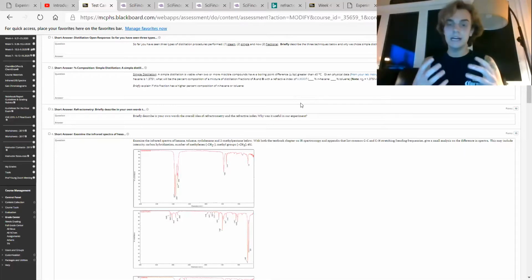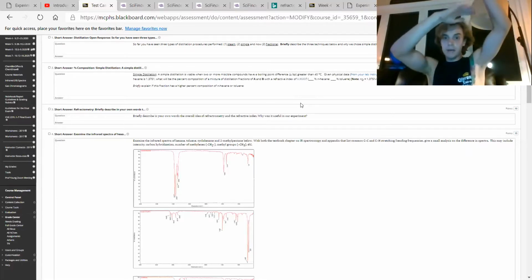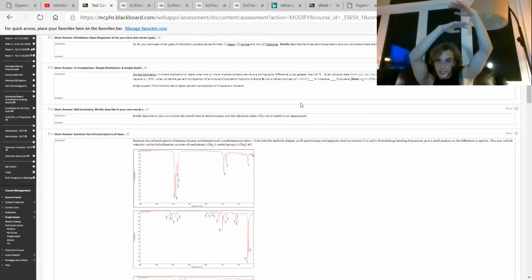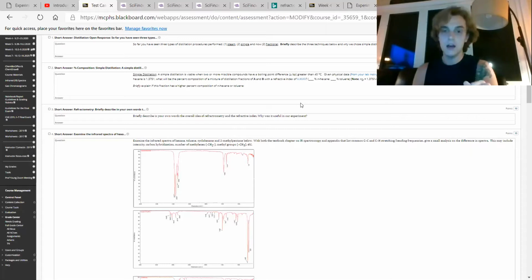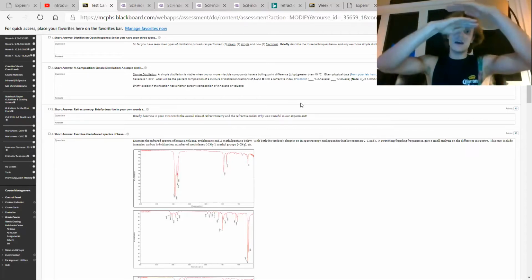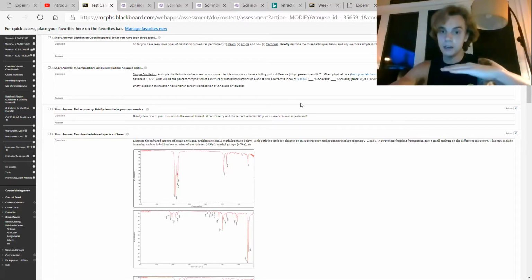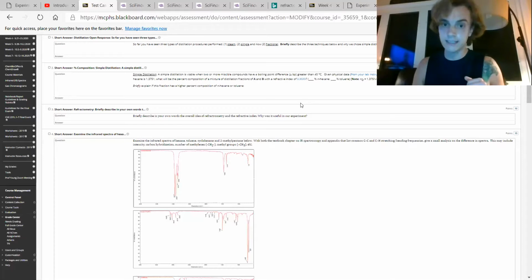So if you're heating the bottom of this system and the top of the system is not heated, and it's a mostly closed system, meaning the top of it is only obscurely closed, then we are able to quantize the volumetric spatial areas of the reaction based on the energy that they're releasing, okay?